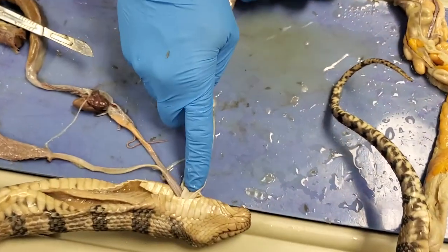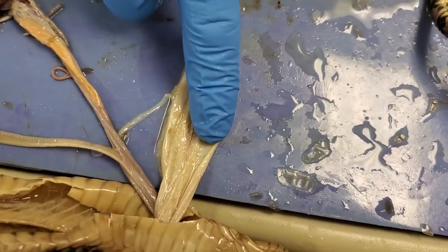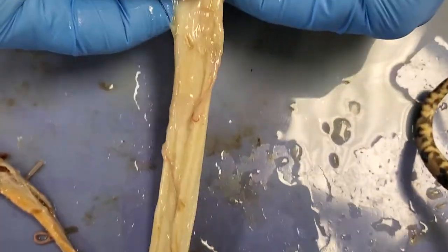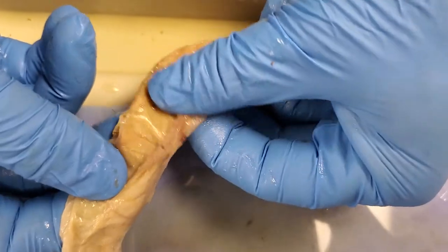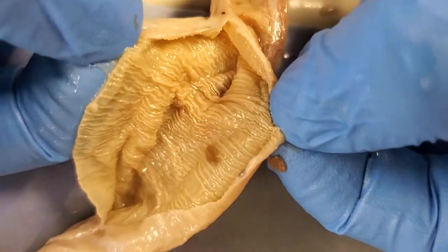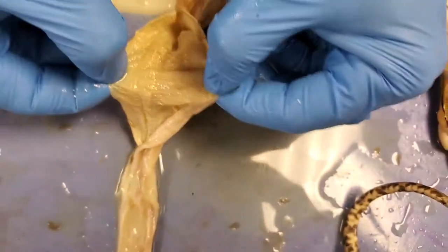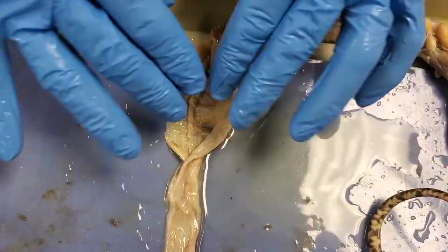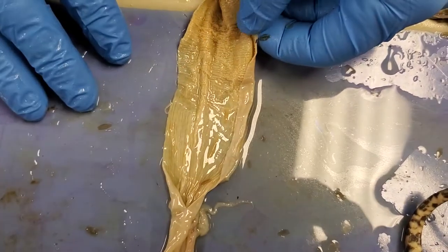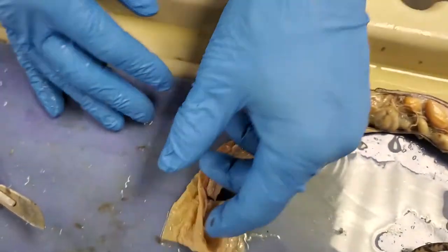Now we move over to the third tube leading from the head. Blood vessels, trachea, and now the esophagus. Snakes have a really wide esophagus and it makes sense because they swallow their food whole — it needs to be able to get really wide. And as you keep going, it stays pretty large down here, and this is the stomach. Definitely hollow. I can kind of open it up and you can see the stomach has all these little ridges in there — these are called rugae. Rugae allow the stomach to expand, like elastic bands in your underwear. Along with those rugae, there are little tiny cells that create hydrochloric acid as stomach acid and other digestive juices. Snake digestive juices are much more powerful than ours.